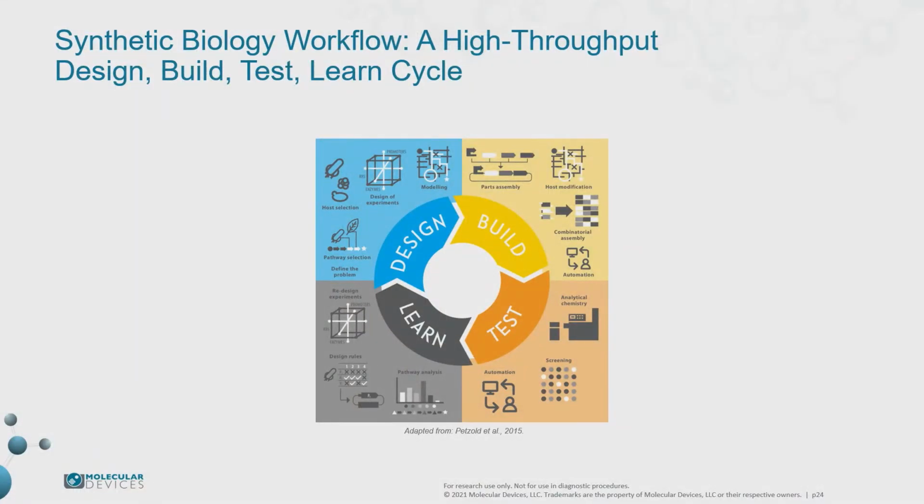Modern synthetic biology workflows are iterative design, build, test cycles that encompass the decisions and actions necessary to design, build, and test target genetic systems. The design process defines the problem and develops an initial design. The build process is where components such as genes and vectors are selected, synthesized, and assembled to incorporate into the preferred host. The test phase is where the design is validated. The learn component scrutinizes the test data, which can inform further iterations of the cycle.